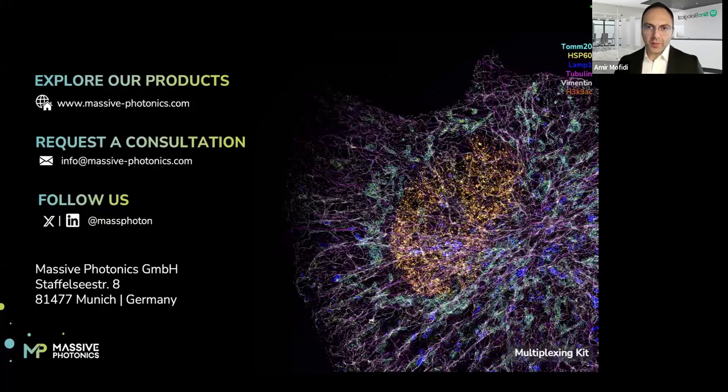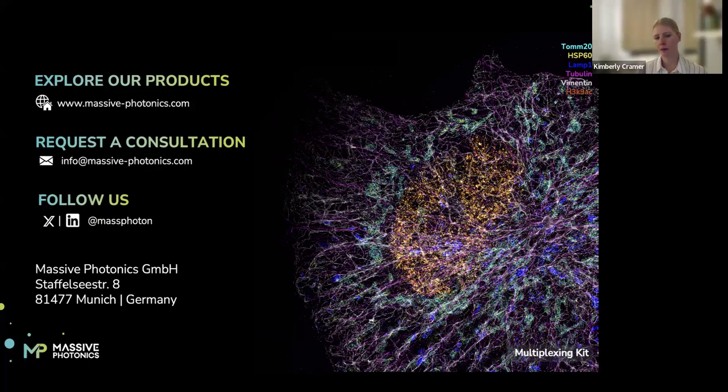So another question from Jinran: what are the DNA-PAINT advantages over conventional microscopy techniques for super resolution expansion? I would say DNA-PAINT is extremely unique in its multiplexing capabilities over both conventional and super resolution methods. You can really image as many targets as you want. That's one advantage, along with generally higher resolutions.